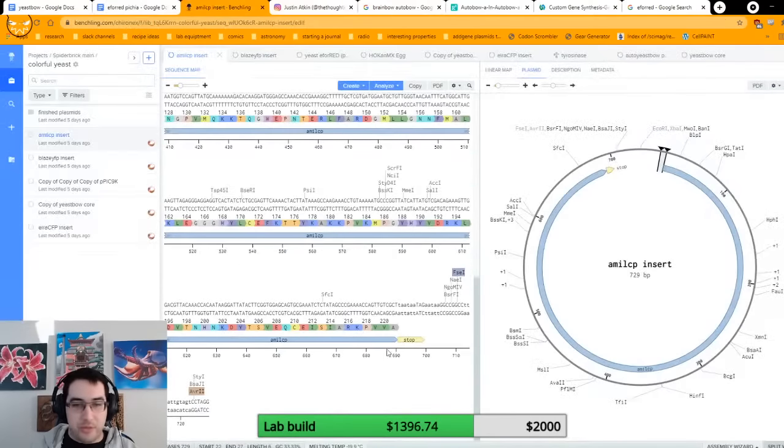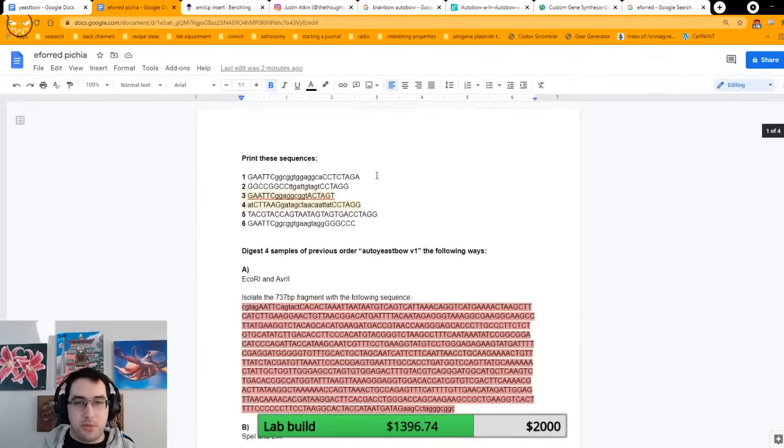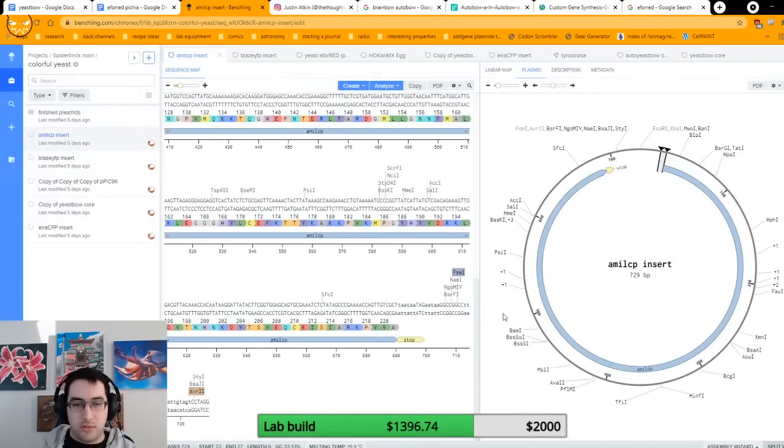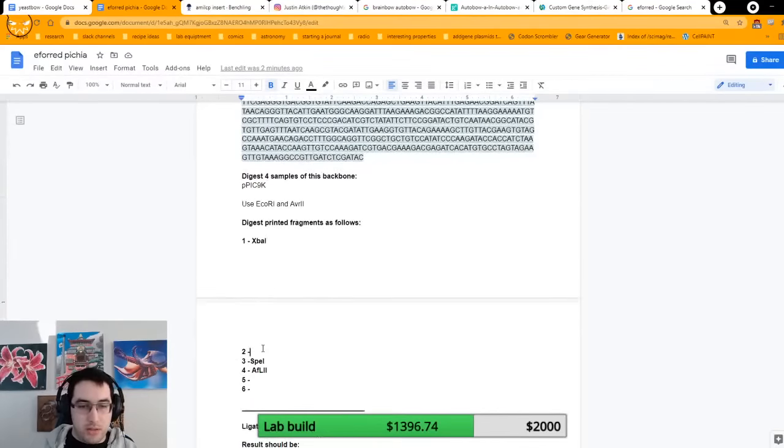All right, scrolling down, this should be FseI, GGCCGGCC. Okay, GGCC, GGCC. Yep, that's perfect. Okay, so that should be, I said FseI. FseI, lovely. Okay, moving along.